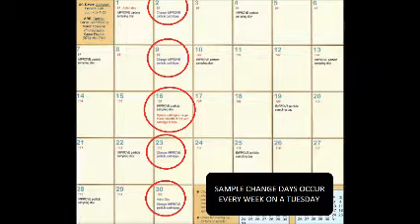If you or a backup operator cannot make it to the site on a Tuesday, please notify an AQG technician in advance, and we can provide you with acceptable alternate dates to perform the sample change in order to minimize the number of lost samples.